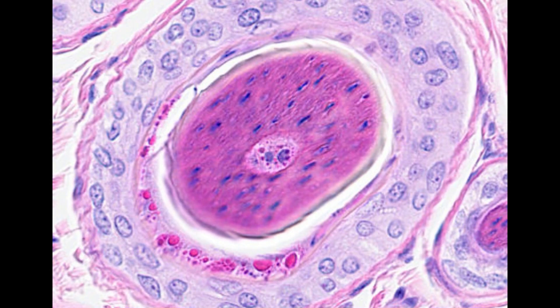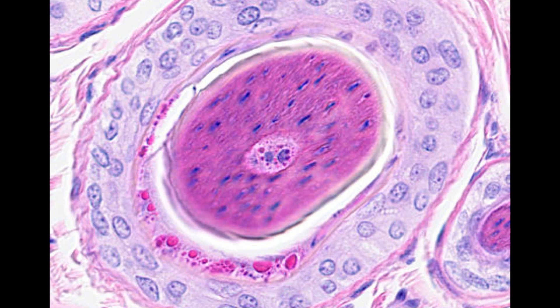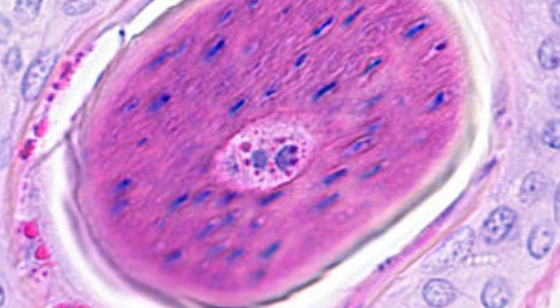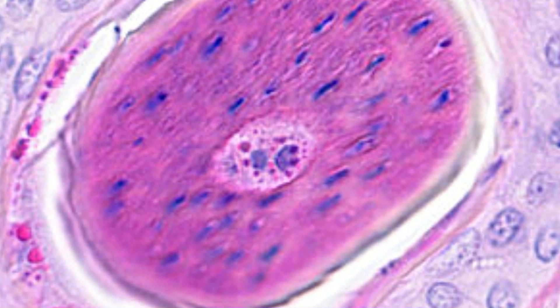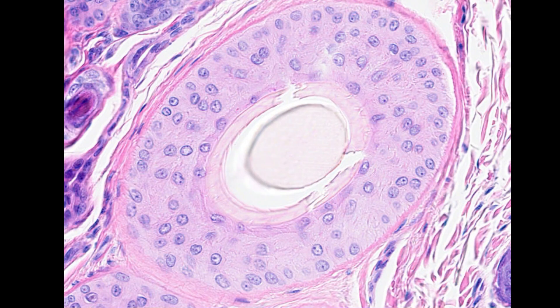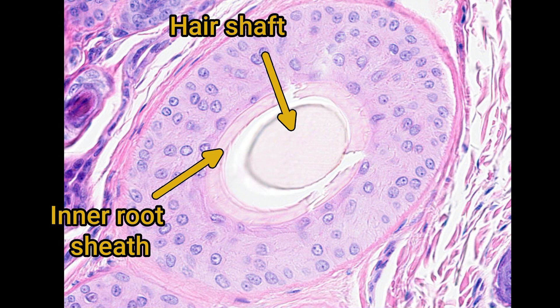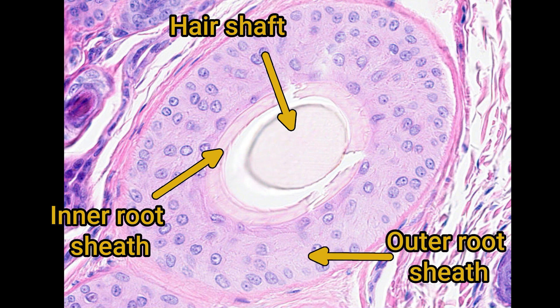Moving up the hair shaft, cornification is well underway in both layers of the inner root sheath and the hair shaft. Notice how the cells of the hair shaft cortex are beginning to lose their nuclei, while those of the cuticle are fully cornified. Once cornification is completed, the layers of the hair shaft are no longer visible; the inner root sheath is fully cornified, and the outer root sheath persists, now fully developed and much thicker than at the start.